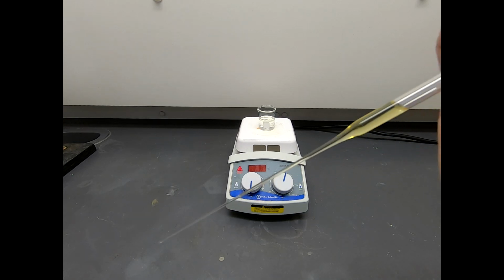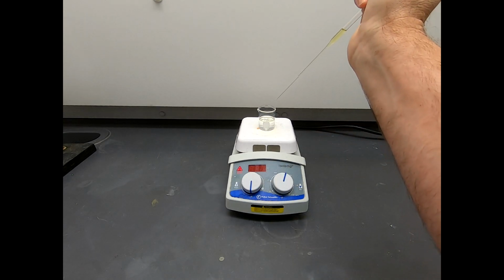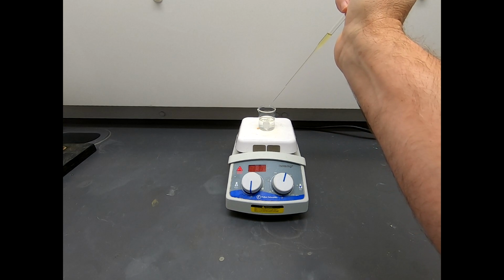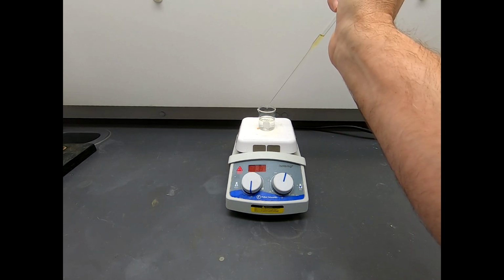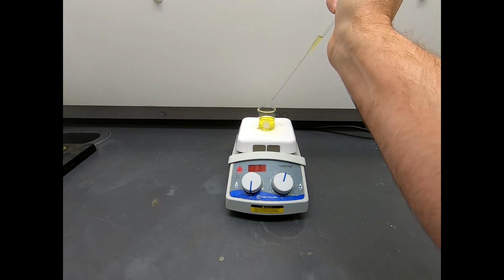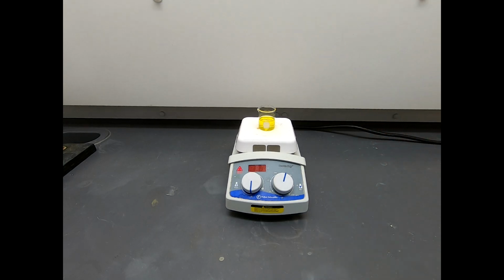Now, I have this in a pipette. You can see it's a little bit yellow, which is not uncommon for amines. I want to add 10 drops to this reaction. So keep your eyes on the reaction. It may change color just a little bit. That's 1 drop of morpholine. There it goes. We're starting to get some yellow. 2, 3, 4, 5, 6, 7, 8, 9, 10. Okay, it's always nice to see color changes. That's a sign that something is happening, and that's what we want.